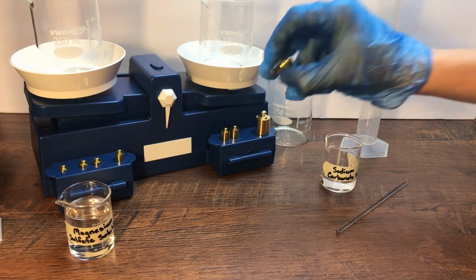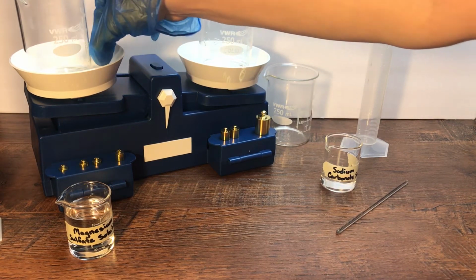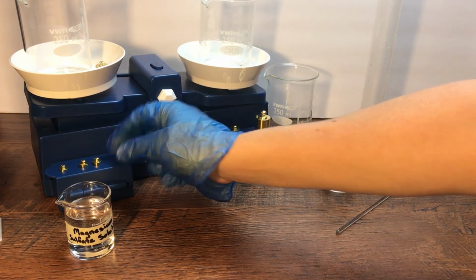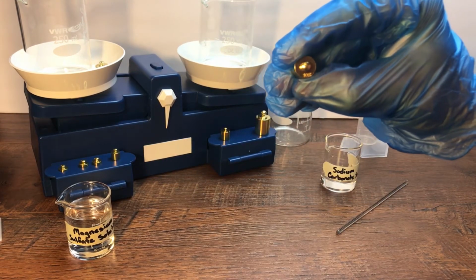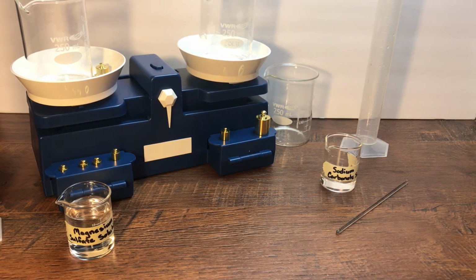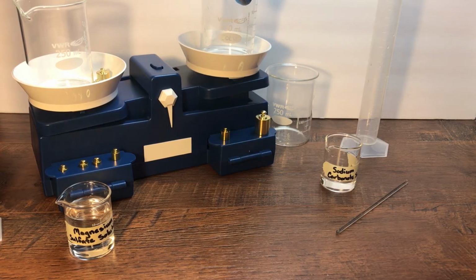So let's start by using our 20-gram weight. We need to add a little bit more. Let's try the 10-gram next. It's our 10-gram weight. There we go. Looks like we have about 30 grams of sodium carbonate solution.